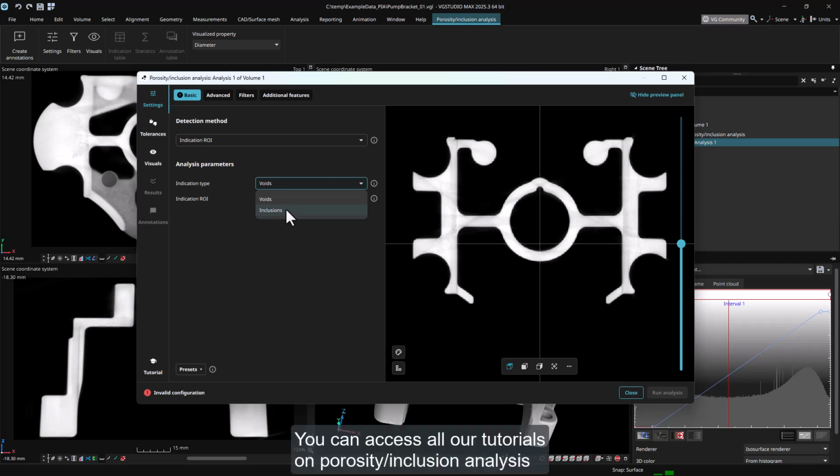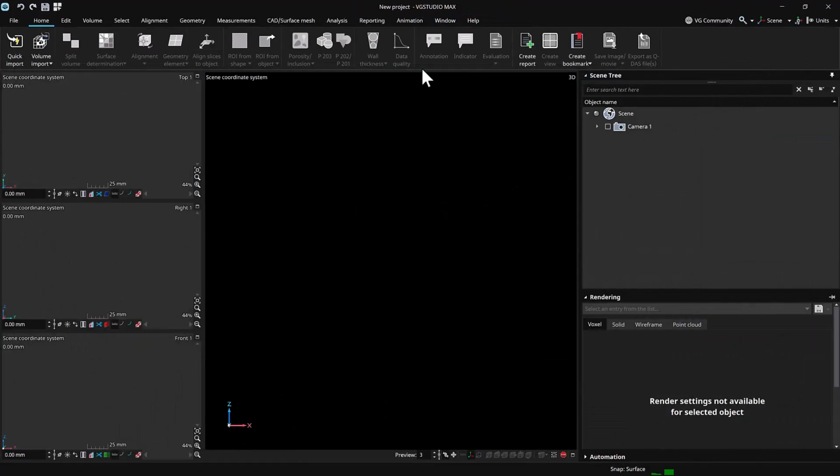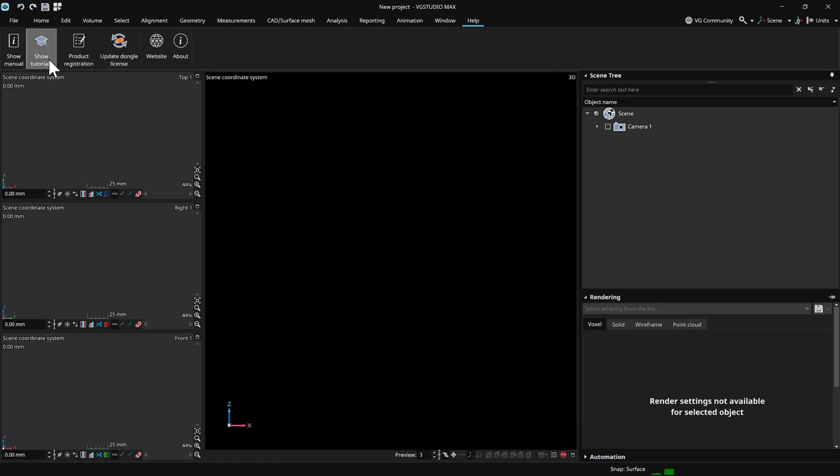You can access all our tutorials on porosity inclusion analysis on our website via the tutorial button in the analysis dialog. I hope you enjoyed this video. You'll find a list of all our tutorials on our documentation landing page via Help, Show Tutorials.